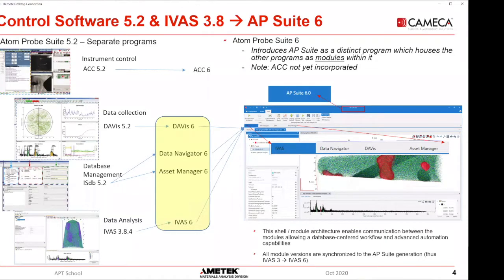We're calling this Atom Probe Suite, and right now we have pretty much everything in the Atom Probe Suite except for the control software, and that'll be the last thing to come. It's probably another couple of years down the road before we get that incorporated.